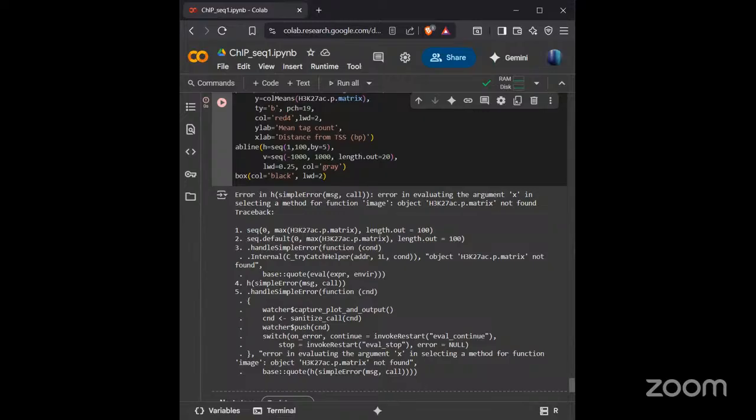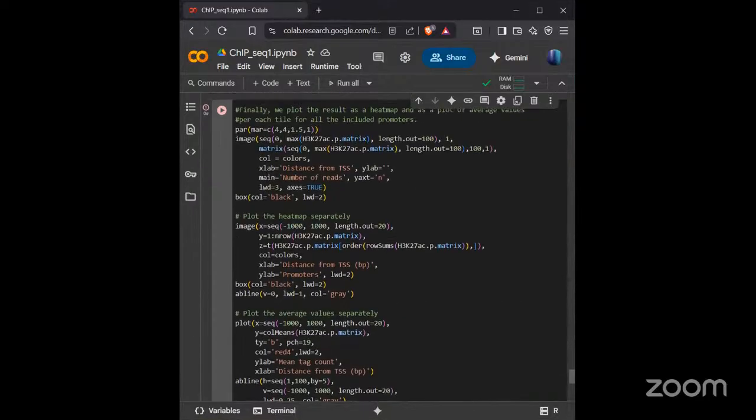Now run it. Now run this. I think that was my mistake. I missed some part of the code. Now execute, Pratima. Still error.